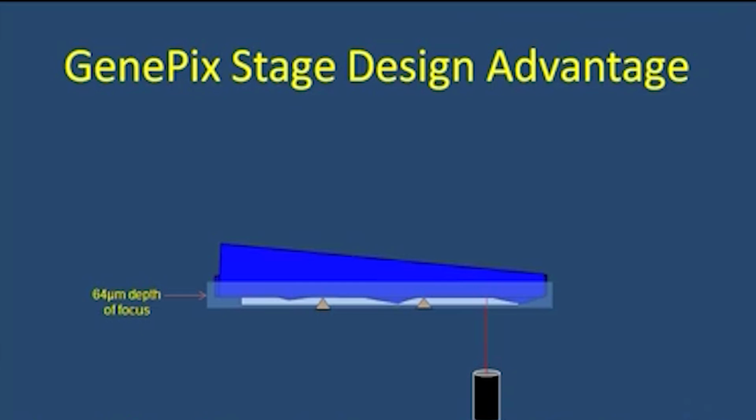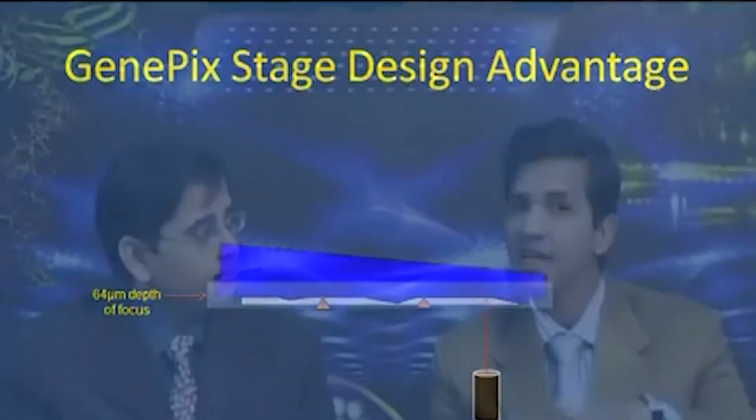So what we do is we invert the slide so that it goes to the level of the same scanning, and they are supported at the level of the edges with the controllers which see the deformities at the glasses. Okay. So what it helps is, it helps in looking at the deformities and directly allow the scanning to happen on the face of the scanning area.